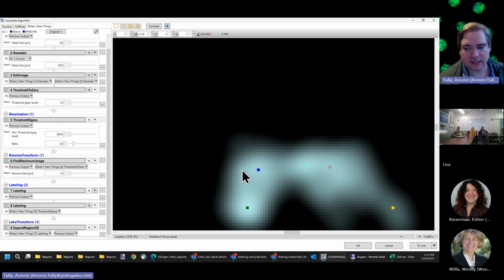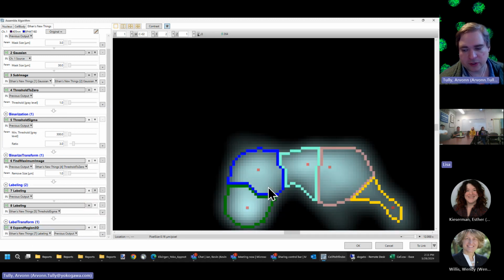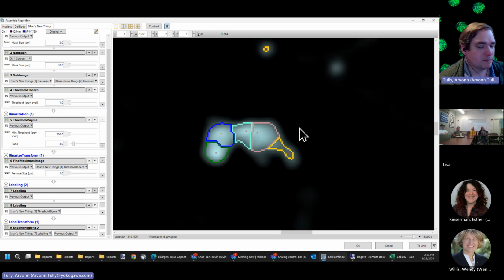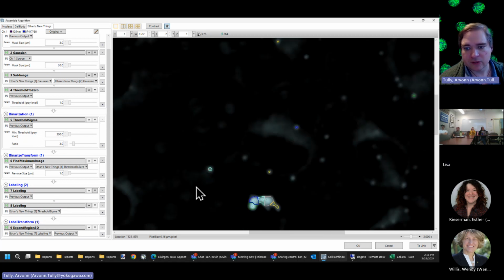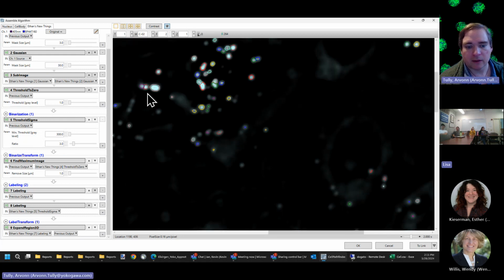So now when I do this, it's going to take each of those and split that out into the threshold sigma level. So now we're going to get segmented objects. So it's basically a seeded watershed. That's how you break apart a seeded watershed into a piecewise solution. We're getting nice segmentations there, and we're getting these split apart. So that's roughly how I would do it.